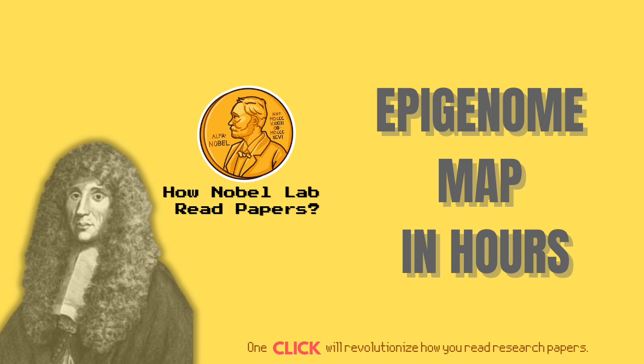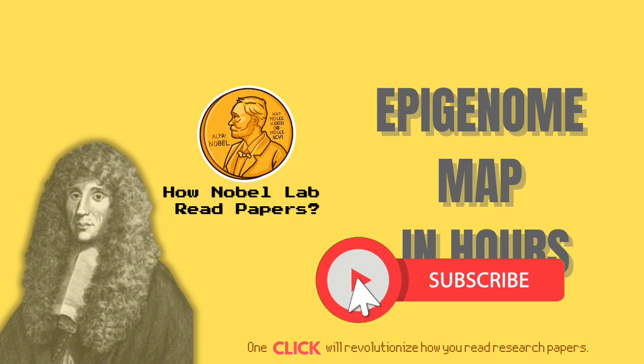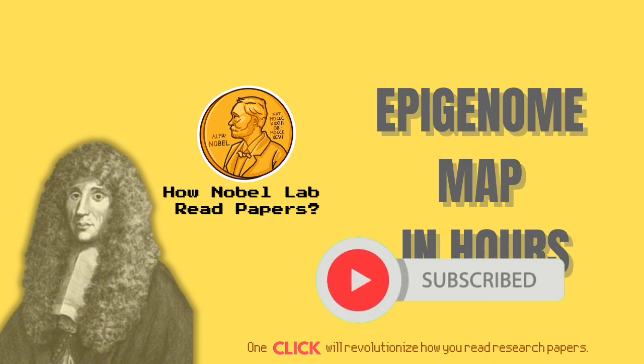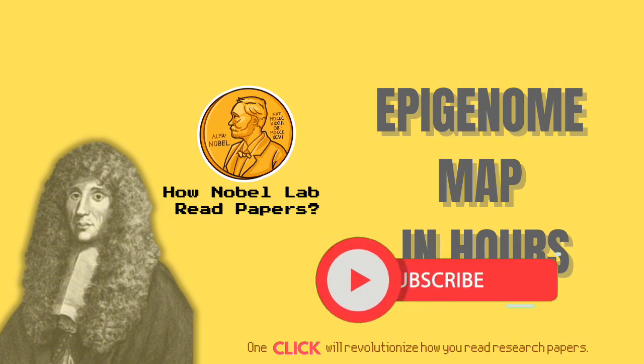And on top of that, you get 3 different kinds of epigenomic data out of the same experiment: accessibility, nucleosomes, and even transcription factor binding. It really addressed a huge need. Before ATAC-seq, trying to map open chromatin, the accessible regulatory bits of the genome, was tough. It really was. Those older methods, like you mentioned, DNase-seq, FAIRE-seq, they needed so many cells, often millions. So forget about using small patient biopsies or rare cell types from primary samples then. Pretty much, yeah. Or at least it was extremely difficult.